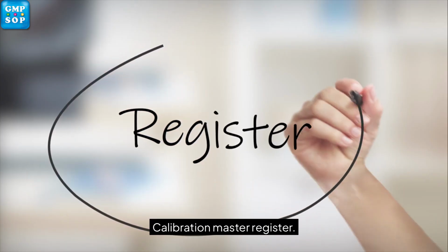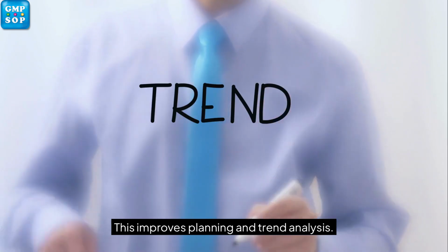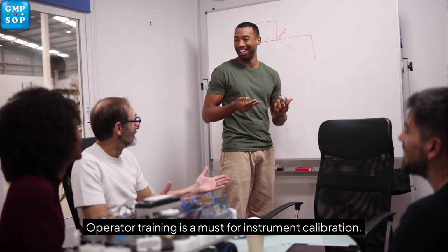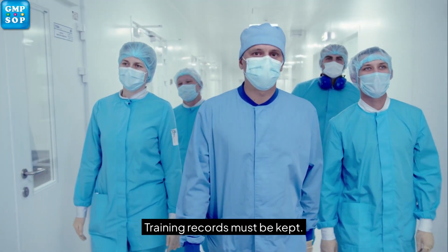Calibration master register. Track calibration history in a master register. This improves planning and trend analysis. Operator training on calibration. Operator training is a must for instrument calibration. Only trained staff should perform calibration. Training records must be kept.